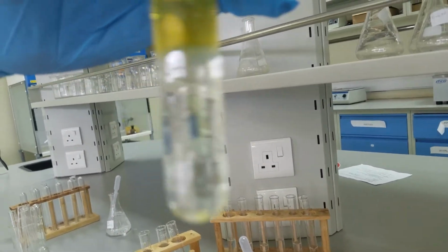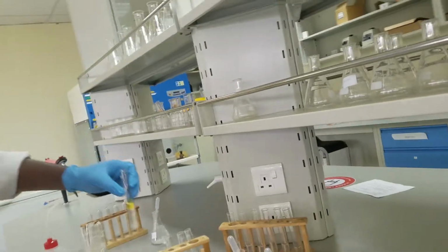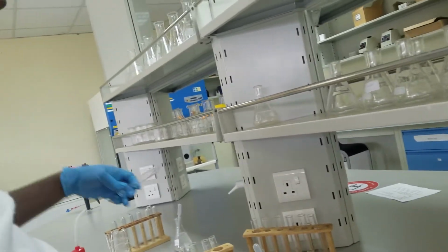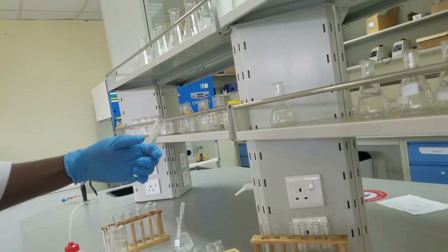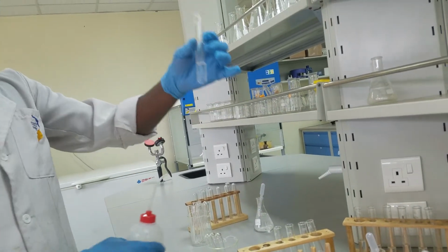So this is what we get with ethyl acetate. So I'll go straight to our unknowns. This is unknown B. Few drops. Distilled water.